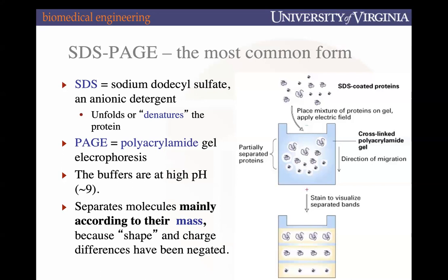The PAGE portion of the name of this method stands for polyacrylamide gel electrophoresis. So we talked about what a gel is. We talked about in the previous slide what electrophoresis is. It's moving these proteins across an electric current down this gel.